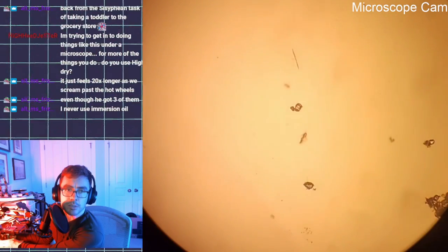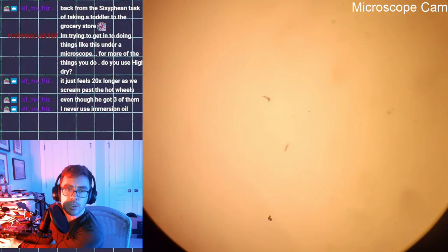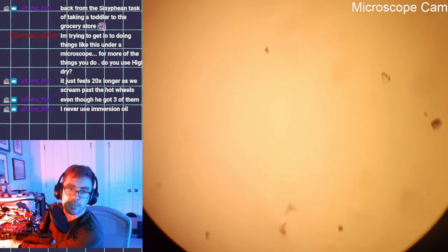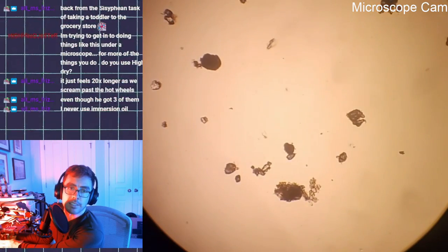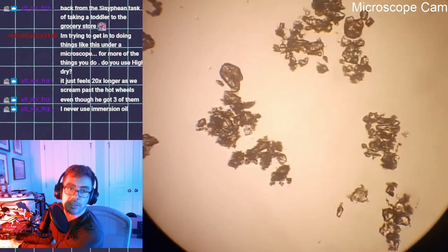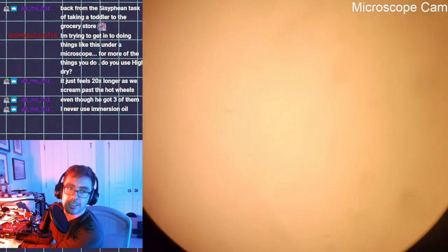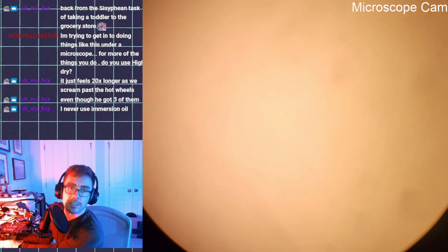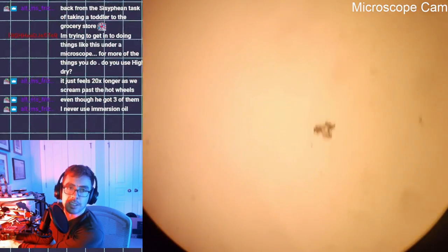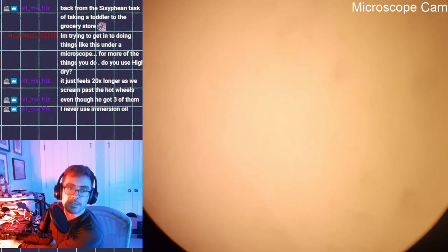Oh my gosh, why won't you stop? You never use immersion oil. I mean, when you can, it's usually because the result is going to be pretty good, but yeah, I don't like using it. I sadly do have a 100x. Yeah, that's my immersion oil objective, but it's not compatible. I was given it basically. I was told like, here, try this, see if it works. It doesn't fit any of our microscopes. And unfortunately, I even got the oil, and it doesn't work. It's just incompatible.